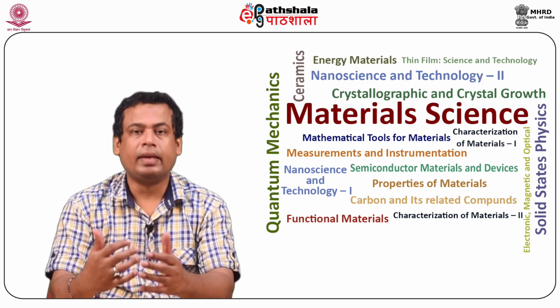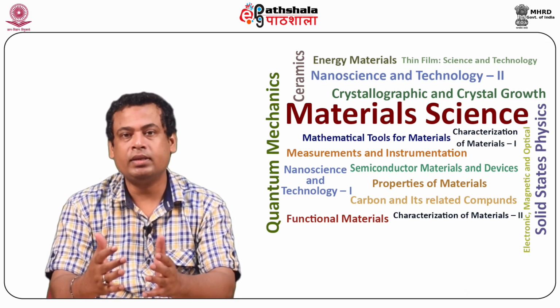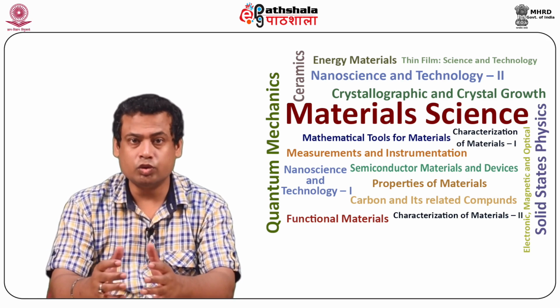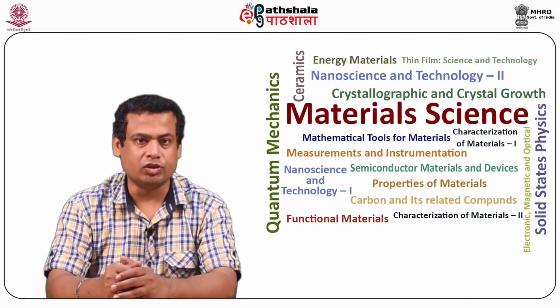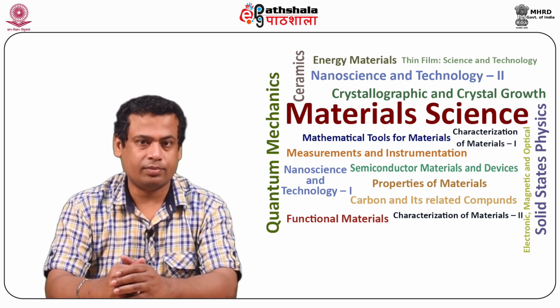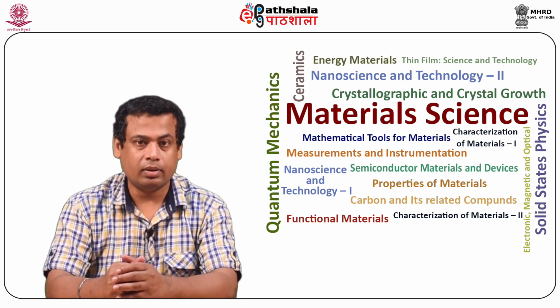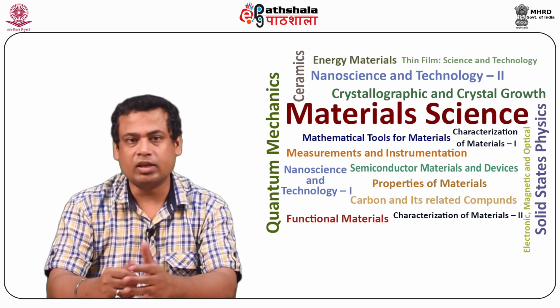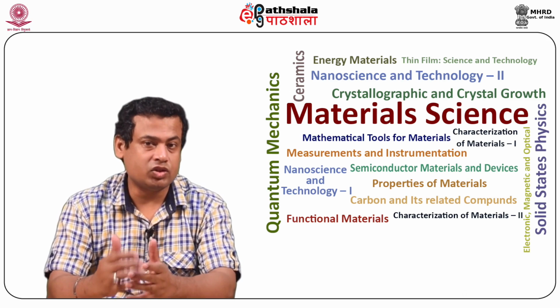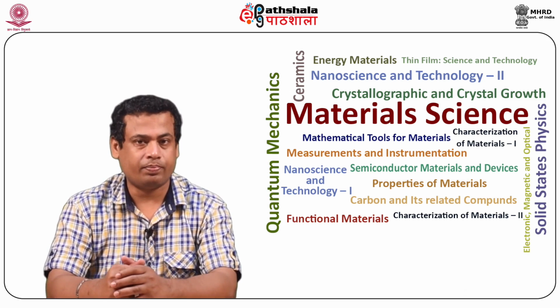Energy dispersive X-ray spectroscopy, generally abbreviated as EDS, is an analytical technique used for elemental analysis or chemical characterization of materials. Each element in the periodic table has unique atomic structures and allows a set of characteristic signals in the electromagnetic emission spectrum.